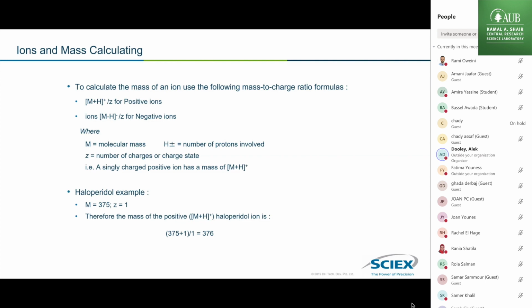However, higher molecular masses, let's say above 1,000, especially proteins and peptides, if you do get into that kind of work, you may see doubly charged or triply charged or higher, and then the ion will show up in the mass spectrum as the mass to charge ratio. So if you have something that is mass 1500, and it has 3 protons on it, then it will be 1503 mass, because you added 3 protons, divide by 3. So you will see it at 501 mass to charge in the instrument. So that's basically what this slide is telling you.